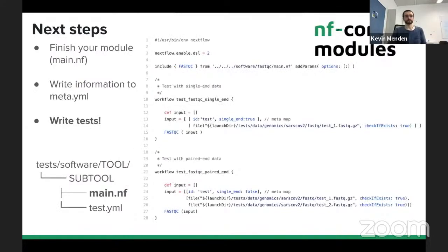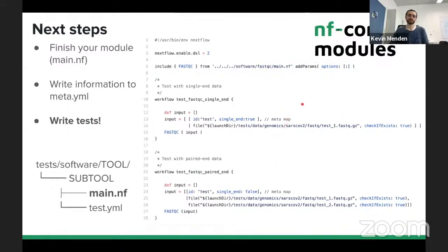Once you have written all your files and set up your versions, the next steps are to finish your module files: write the Nextflow code, write all the information to the meta.yaml, and then write the tests. Here you see the main.nf file of the FastQC tool. You include your module from your software directory. In this particular case, we have two tests - one for single-end data and one for paired-end data - both workflows that define some input and then run FastQC on it.